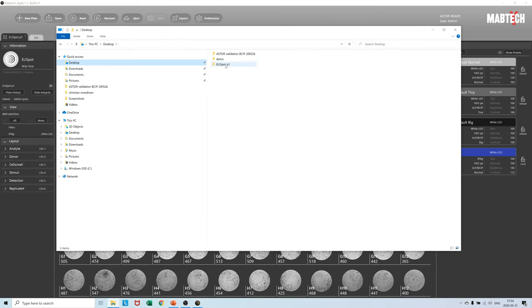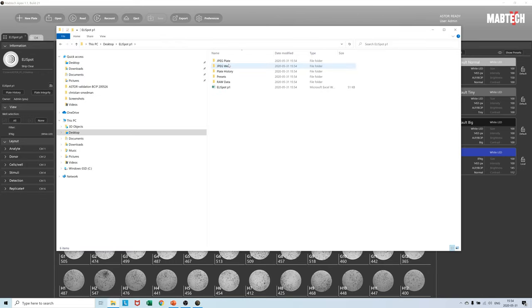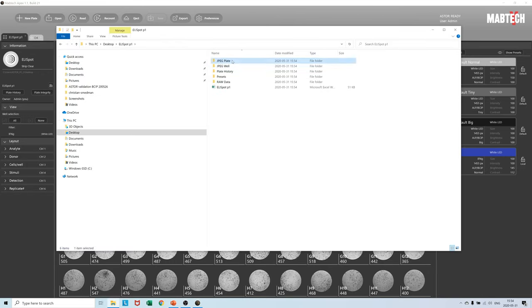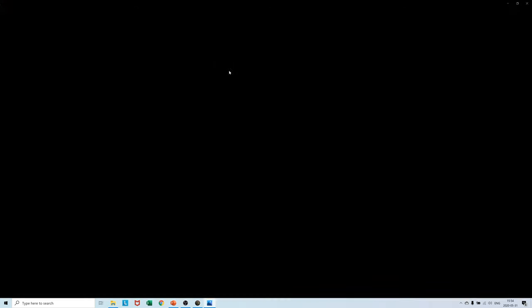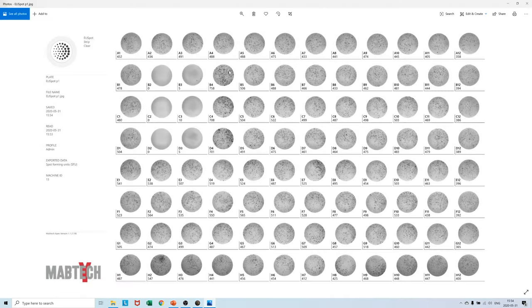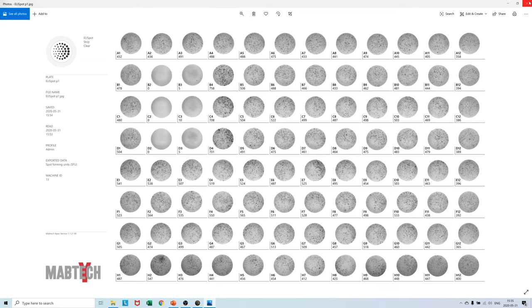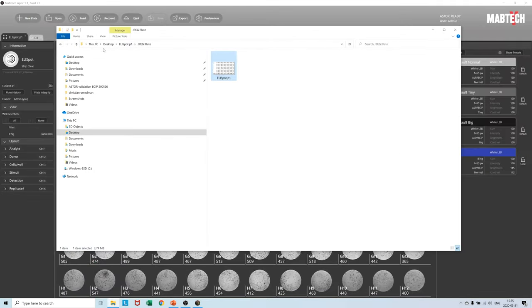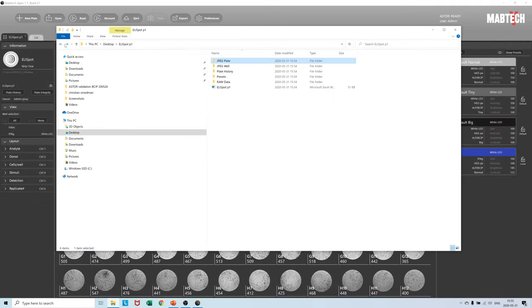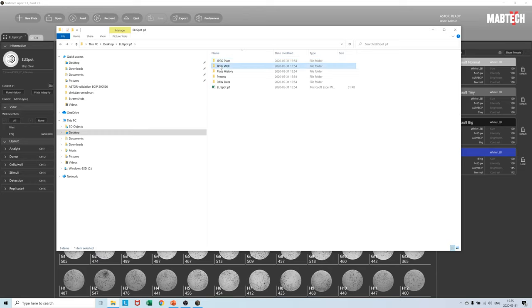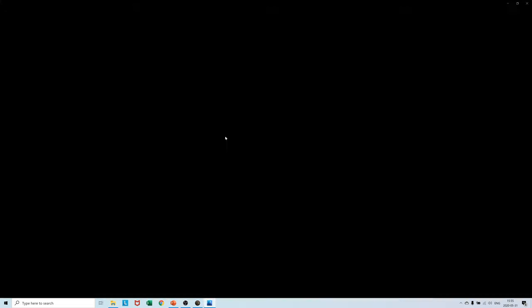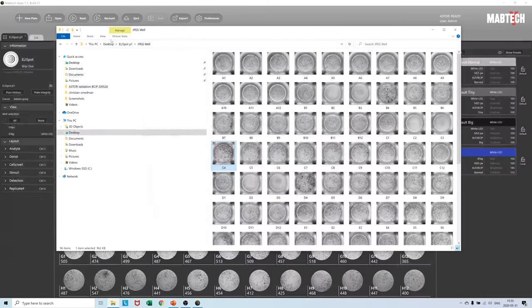First and foremost we have the JPEG plate subfolder containing an overview of the entire plate with spot numbers. On the left hand side fundamental information about the plate reading can be found together with user and machine ID. JPEG-Well contains the individual Elispot images in high resolution.